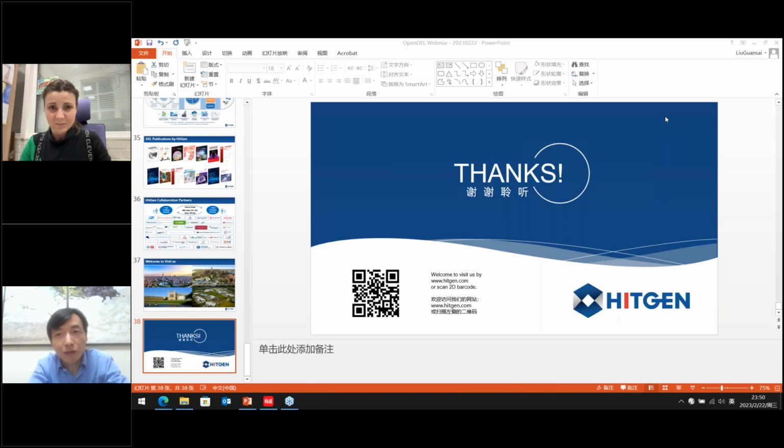If you have time, you can read it, it's an open access paper. We published a paper on using the DNA-encoded chemical library for RNA target selection. But RNA target selection is much more complicated than traditional target selection because of some unspecific binding between the DNA and the RNAs. So we developed some methodology for the target selections and also for the data analysis.